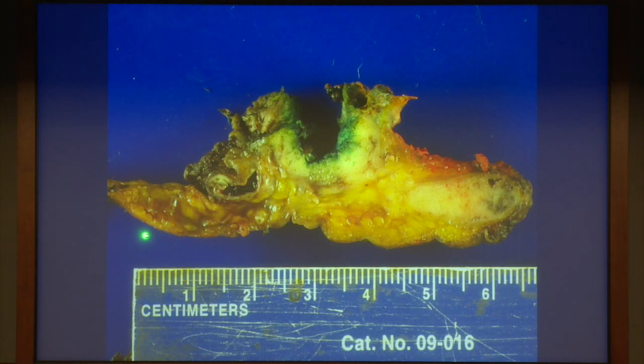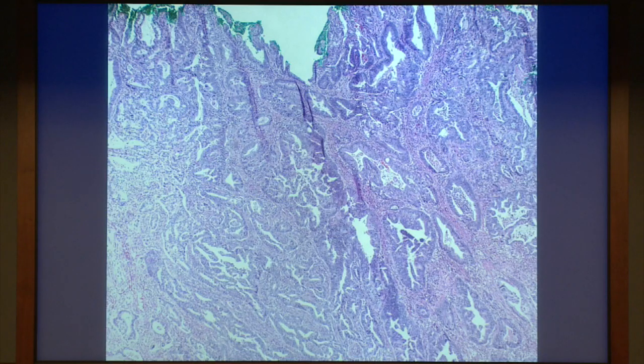So in this example, this is a slice right through the head of the pancreas. This is the radial aspect of the resection, and this painted green is the common bile duct, hugely dilated because it was obstructed. So this is a classic cholangiocarcinoma arising in the intrapancreatic portion of the common bile duct. And so you can see there's a nodular mass here, and so that is straightforward.